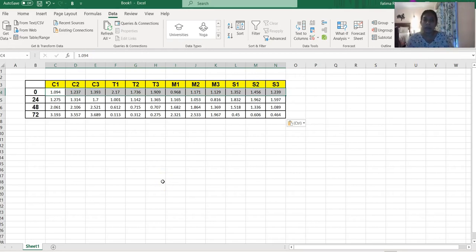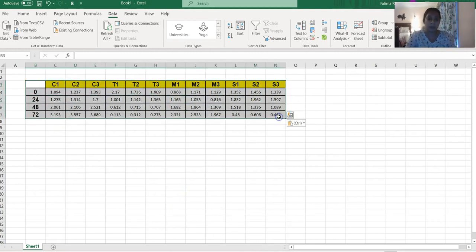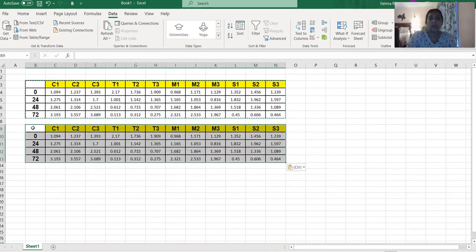So the first thing we're going to do, and in the assignment, it asks you to make a separate graph or separate table organizing each of your samples. You can do that following those instructions, or you can also just pretty much copy and paste this exact table right underneath and convert all the numbers at the same time to the relative growth.